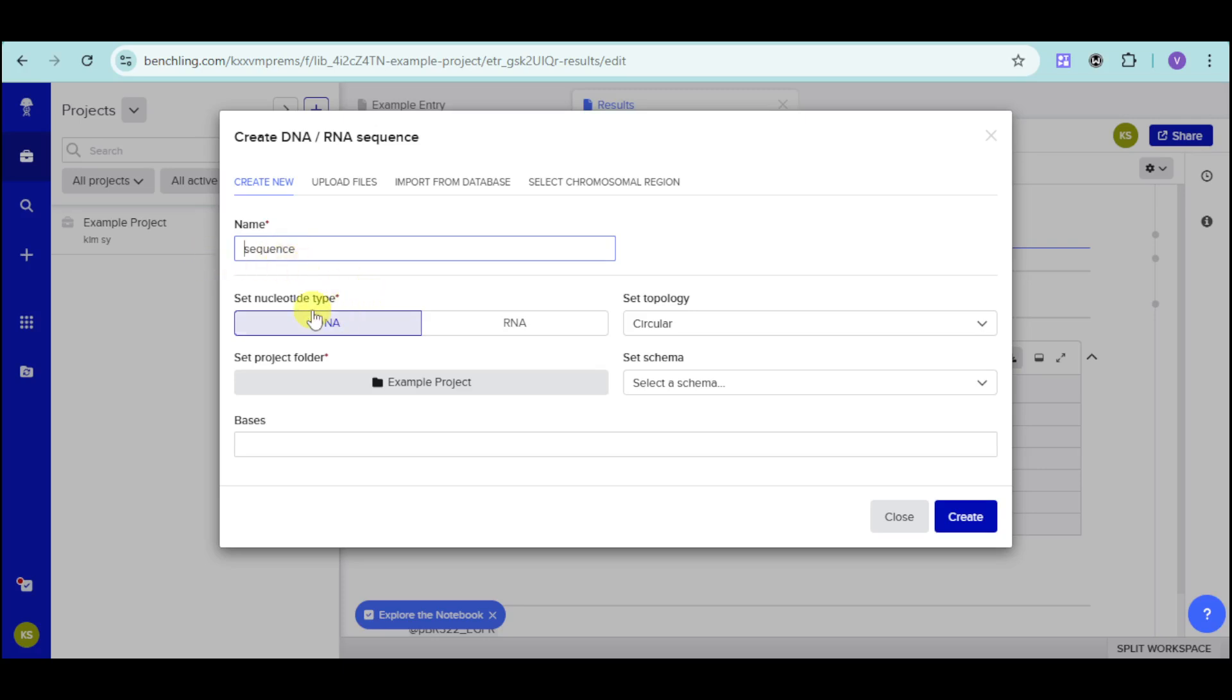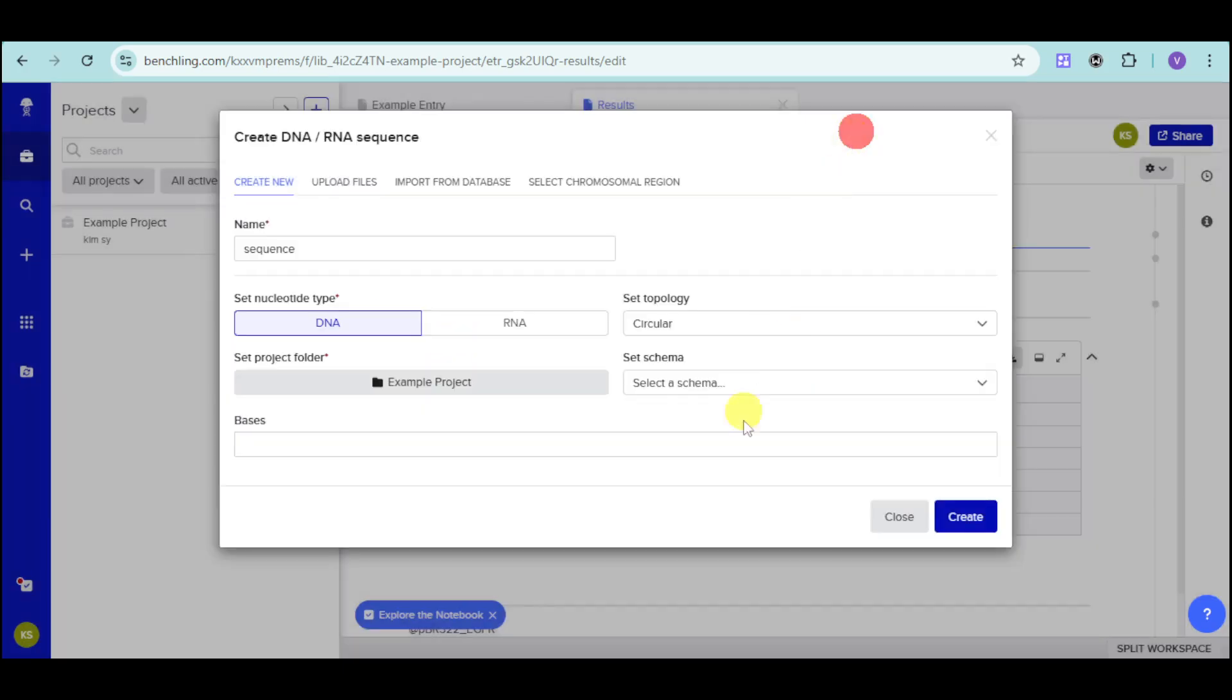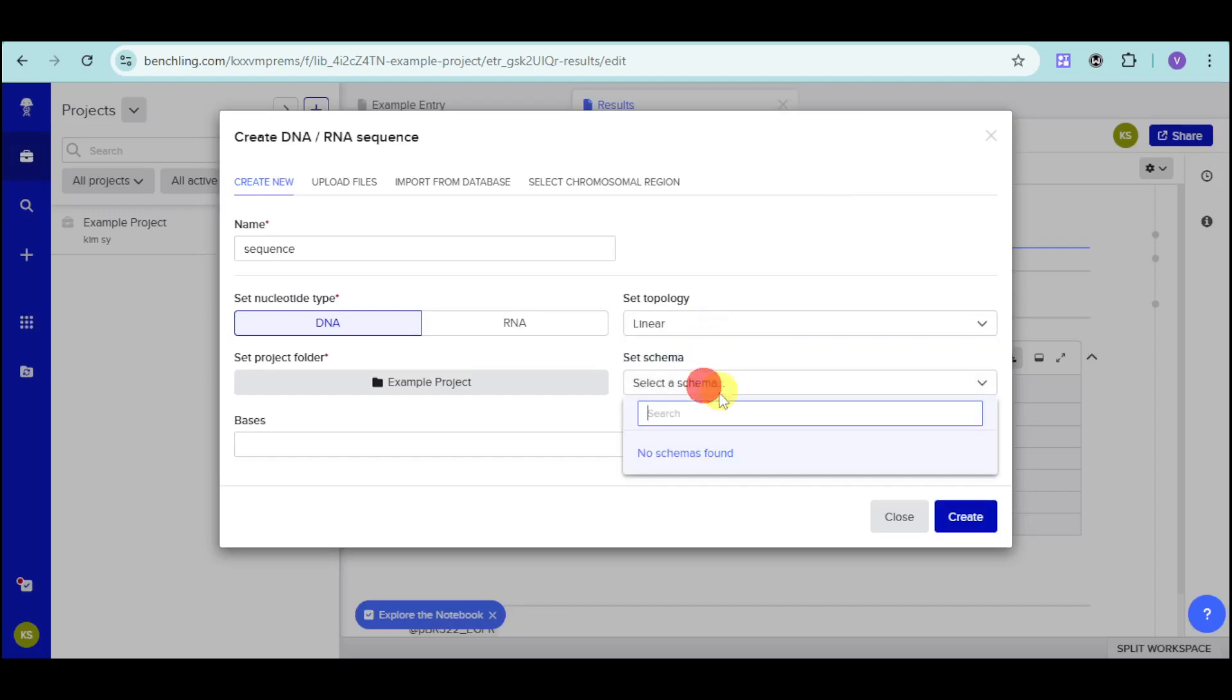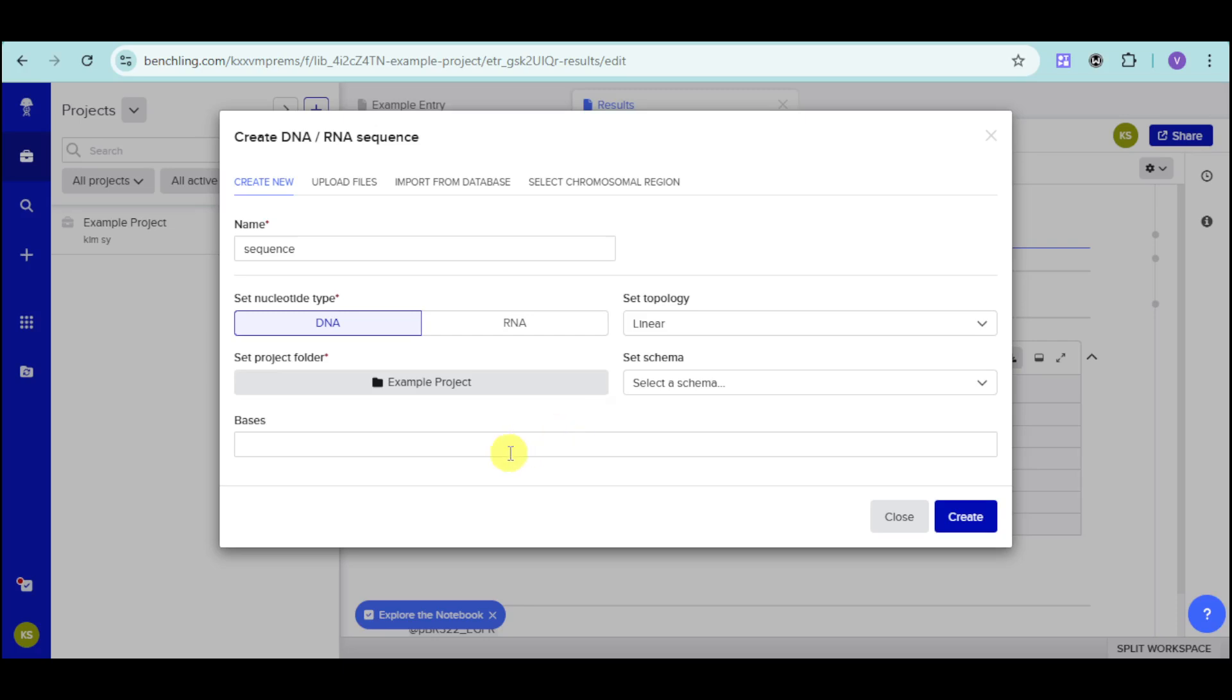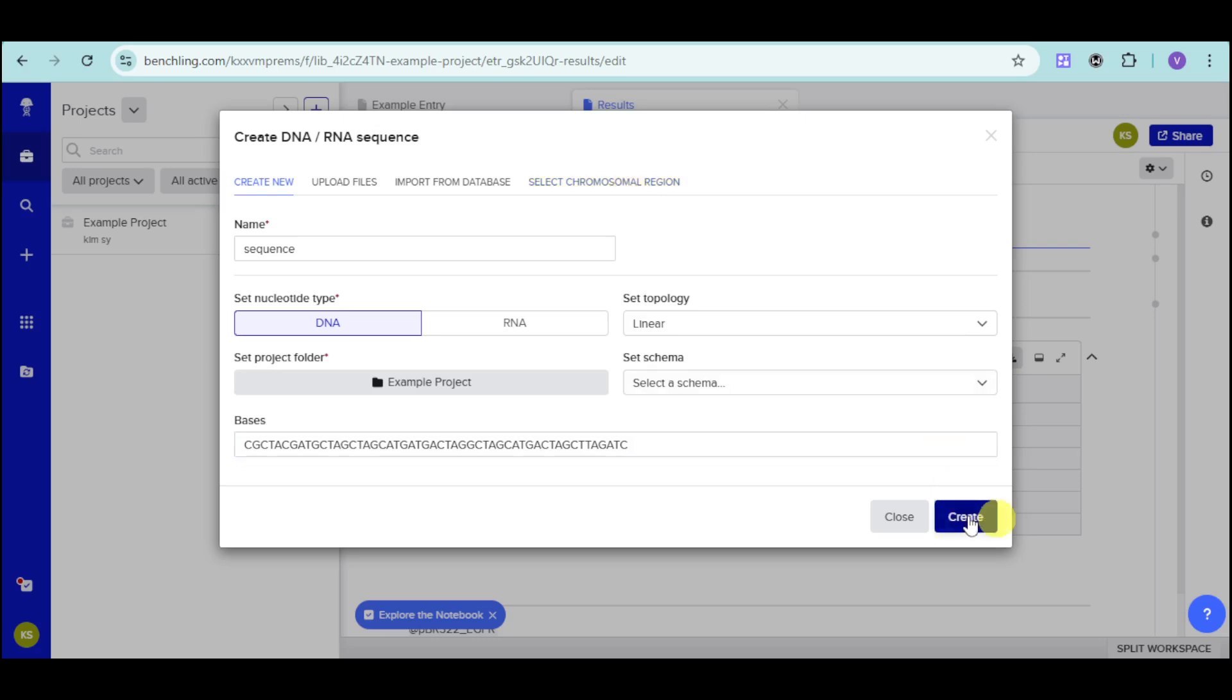You can just name this particular sequence that you would want. And then, input read here the nucleotide type. It can be a DNA or RNA. Then, set the project folder. Let's add it onto the example project. And then, set the topology. Let's choose linear and the schema that you want. Now, input read here the basis. Let's put in here this basis that we have for this particular DNA. You can also import from known databases like BLAST or NCBI. Then, after you have done that, you can also upload files, select chromosome region, and the legs. Click on create once you're done with that.